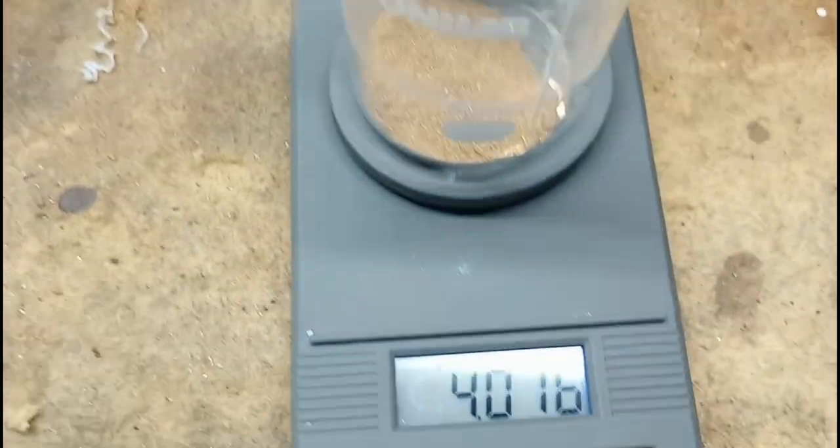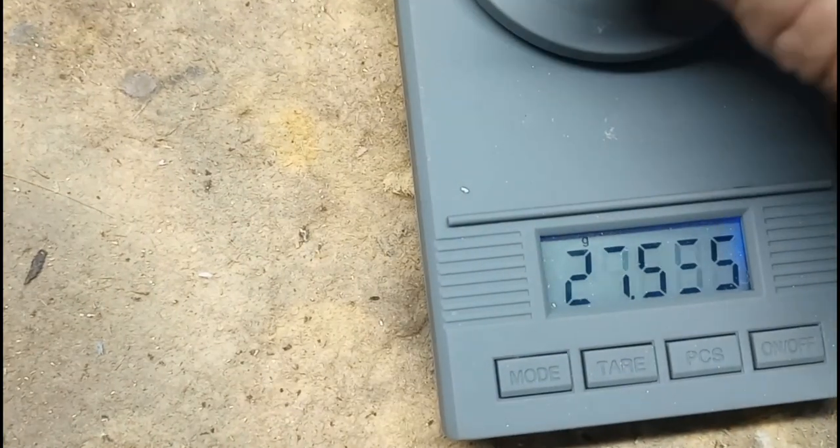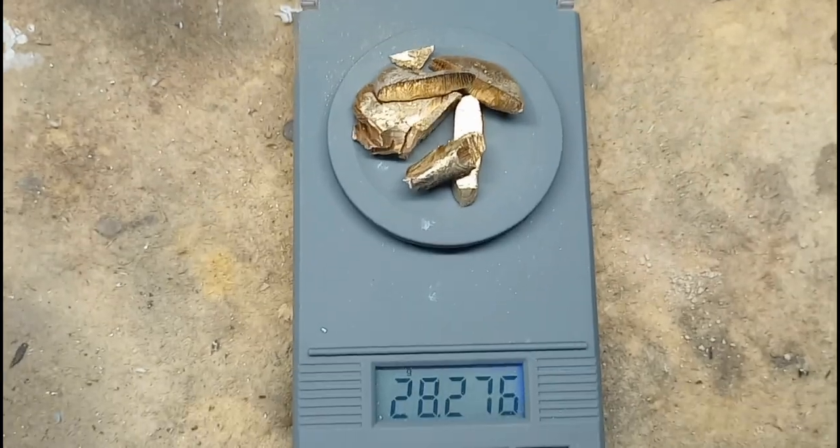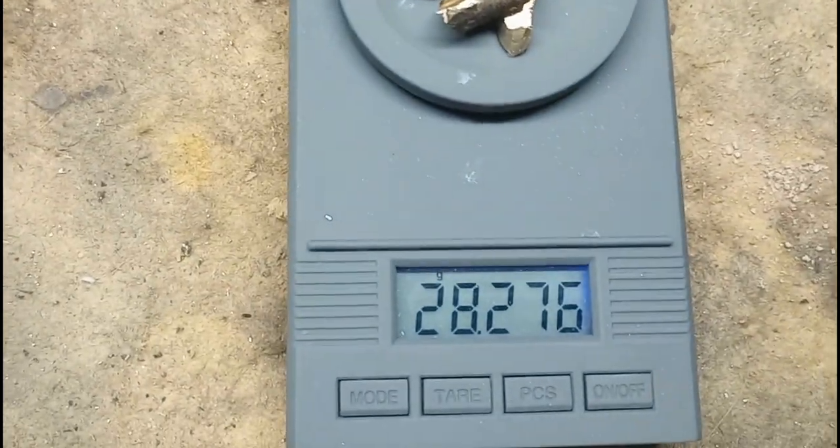The powder weighs 4.016 grams and the other solid pieces weigh 28.276 grams.